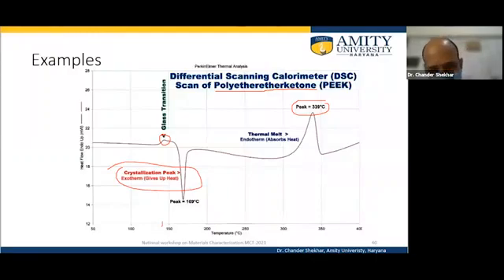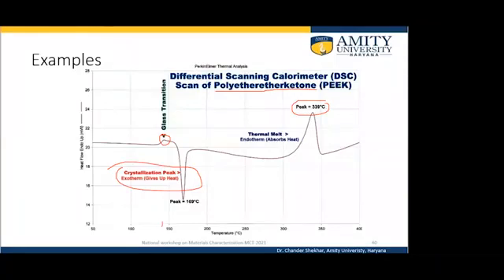In DTA, it is the temperature difference, and in DSC, with power compensation, it is the power given to the sample, whether increased or decreased, during an endothermic event. That physical parameter that is extracted is the only difference. Otherwise, in DTA as well as DSC, the same event is occurring.